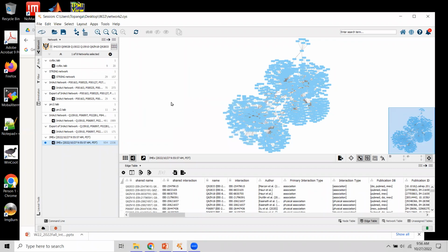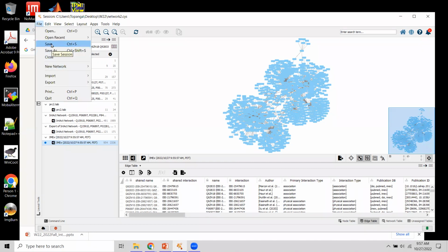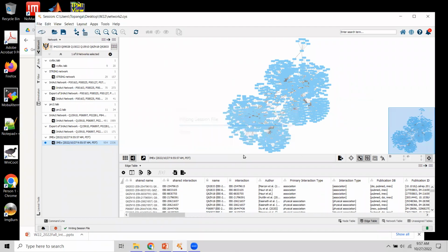The IntAct app is using a smaller version of the files, more efficient to be sent through. So that's why it's a little bit faster. But information content should be essentially very similar. So let's file and save it once more.